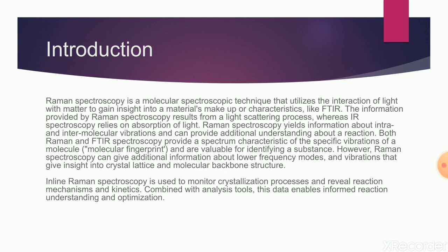Okay, introduction of Raman spectroscopy. A molecular spectroscopy which is observed as inelastically scattered light allows for the interrogation and identification of the vibrational state of molecules. As we know, it is used for product forming and for the change of state, stresses and strain, crystal form and crystallinity. As a result, Raman spectroscopy provides an invaluable analytical tool for molecular fingerprints as well as monitoring change.